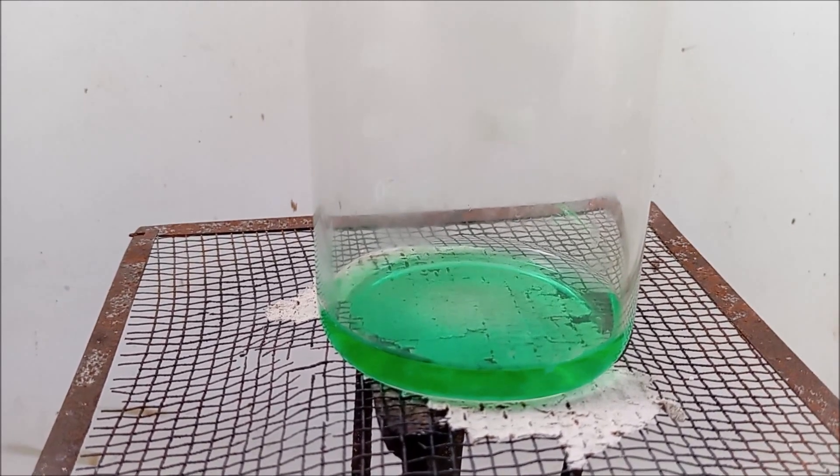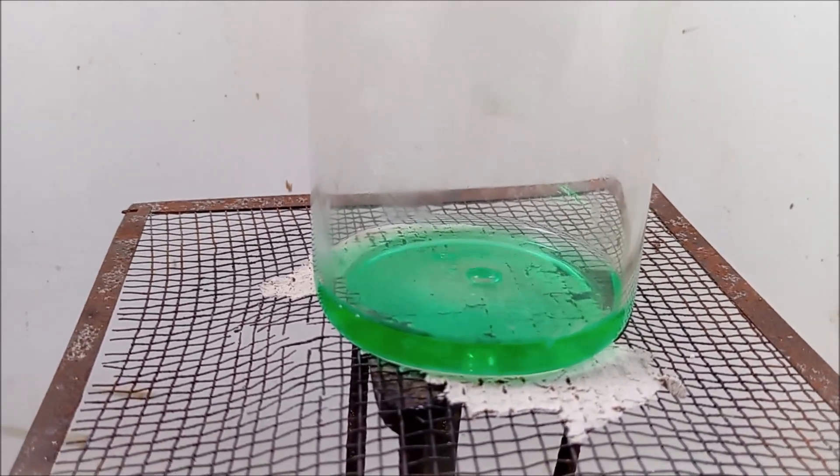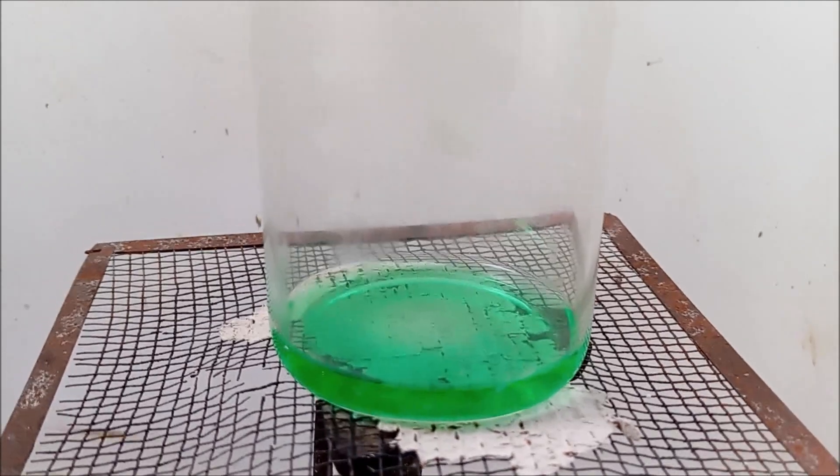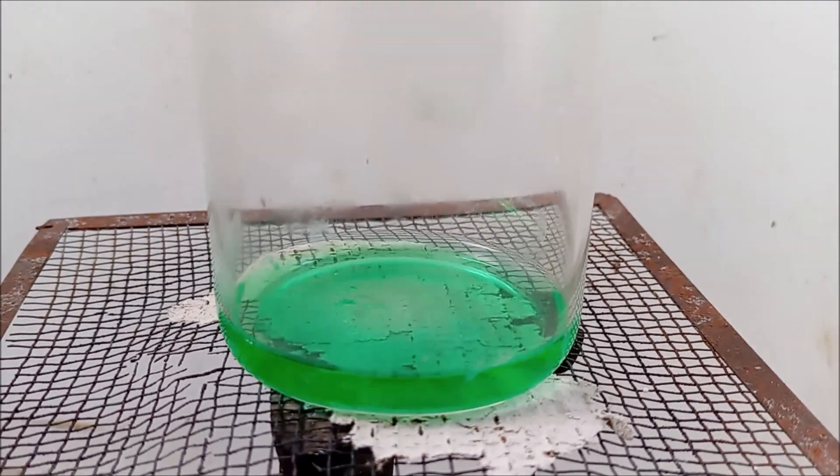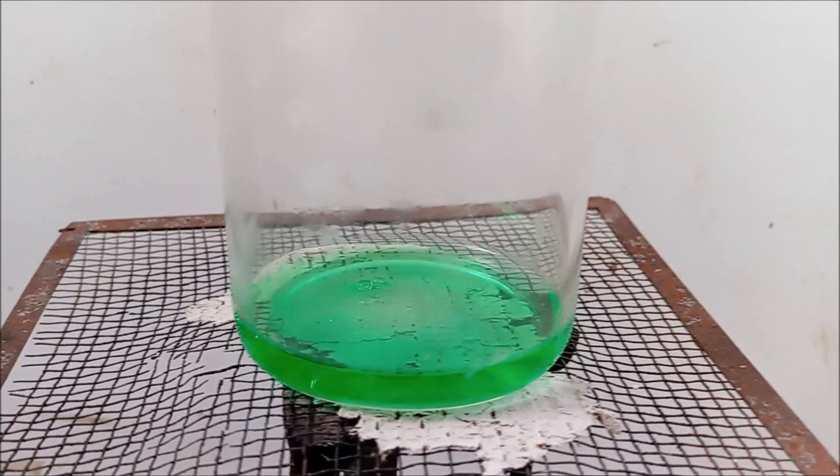If the metal doesn't dissolve for you completely, add another 5 milliliters of 1 molar sulfuric acid and try again. Now boil the solution for 2-3 minutes to expel hydrogen peroxide. Allow it to cool at room temperature.